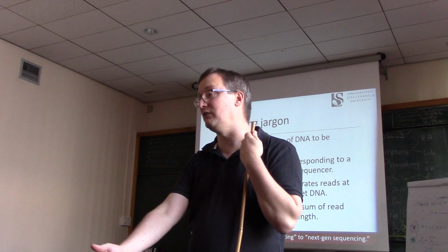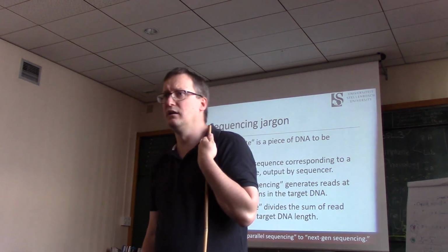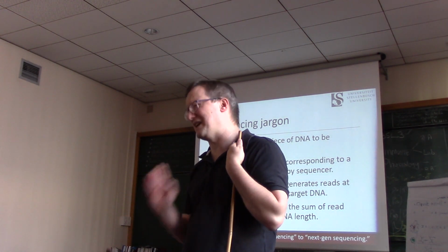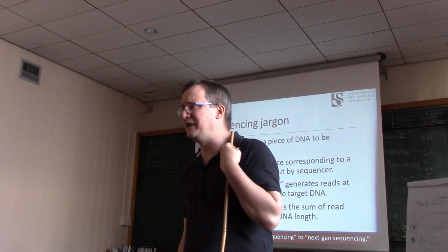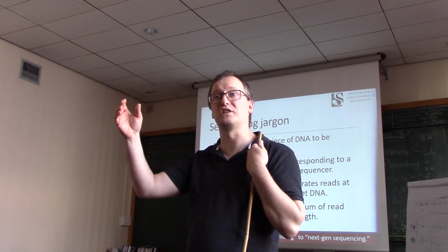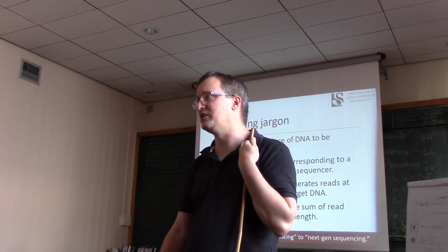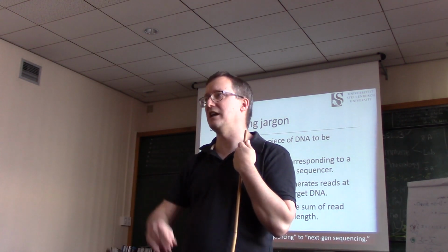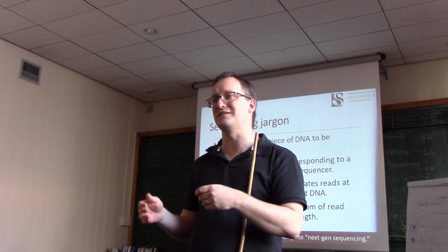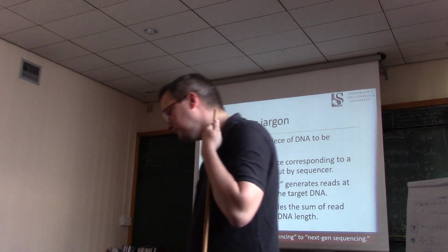And in massively parallel sequencing, we have millions of templates. Next, a read. A read is a really important bit of language. It shows up all over the place, so make absolutely sure you know this one. A read is a set of sequential letters that correspond to the complementary sequence of a template. So it's one individual sequence out of this. If you have 10 million templates, ideally you would have 10 million reads produced from them.